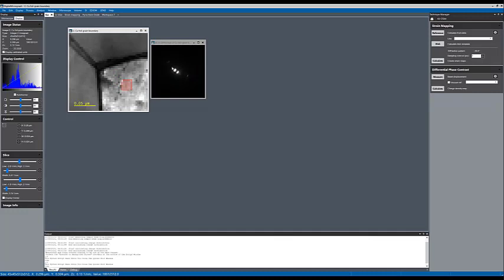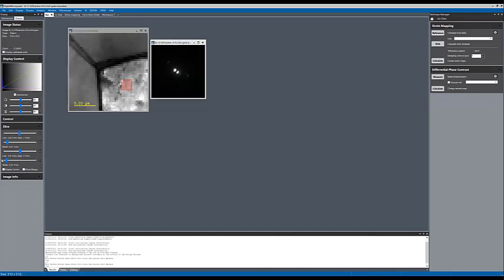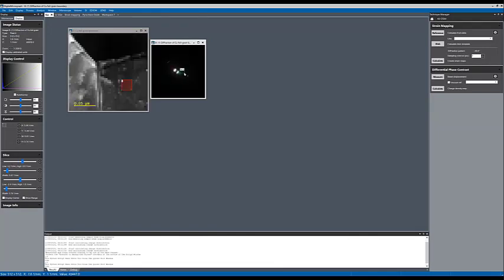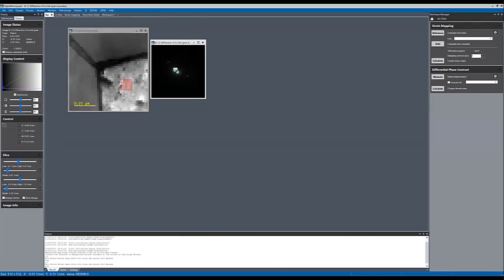The next thing is, on the left-hand side here, I have the slice. If I click on my diffraction pattern and select show range, you can see that as I move this green box, which is selected by the slice, the sliders on the slice move.